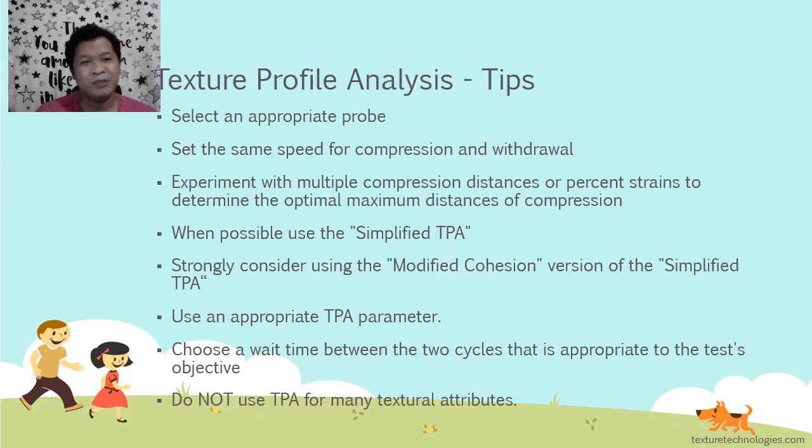So, kung umabot man sa punto ng buhay nyo na nagtitesis kayo and either meron na tayong TPA sa CHE or at face-to-face na or magpapa-TPA kayo sa labas like sa DOST or anywhere else, ito yung mga kailangan yung tandaan. First is that you need an appropriate probe for the application. As you can see dun sa nauna nating video, ang daming probes.